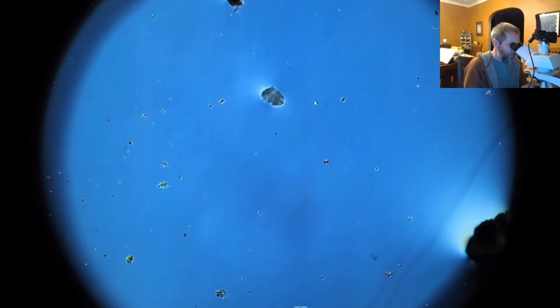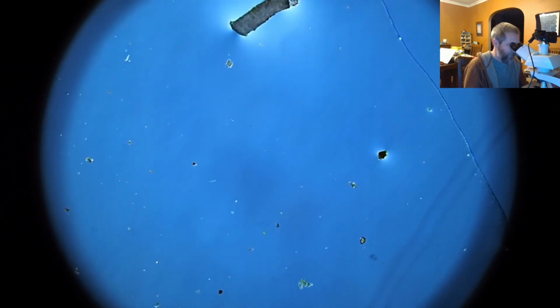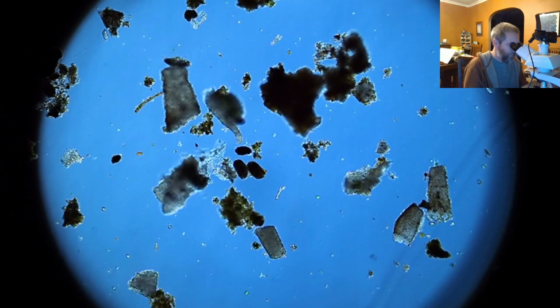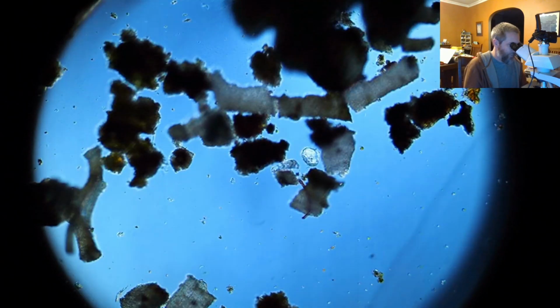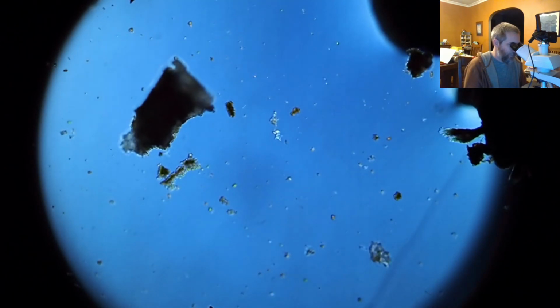Well, every time I just grab a stick and do some of this scraping, I would say that I usually get, when I pipette it up onto my slide, maybe 3. I mean, they're not super dense in that environment. If they were really dense in the environment, I'd see dozens of them in a sample because I'm concentrating it somewhat.